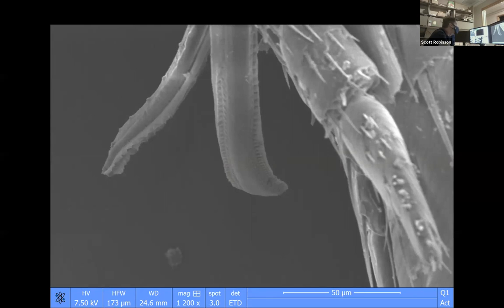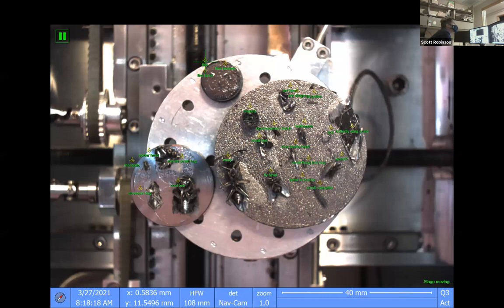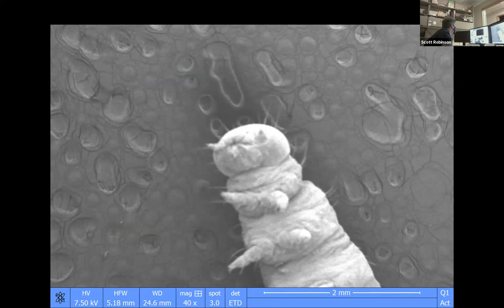Someone in the chat asked if we had any gnats. It's sort of a generic term for a tiny fly that will swarm around you and annoy you, so it doesn't refer to any specific insect. But I don't know if you have any flies that might be considered gnats on there. We have an aphid. An aphid? No, we'll consider them gnats. Yeah, so the aphid is near this, but I just found this is kind of cool too.